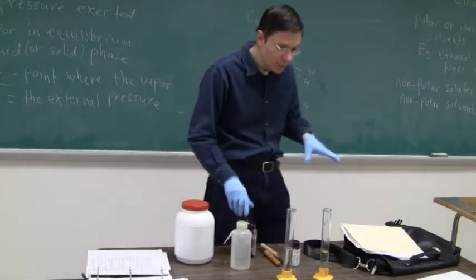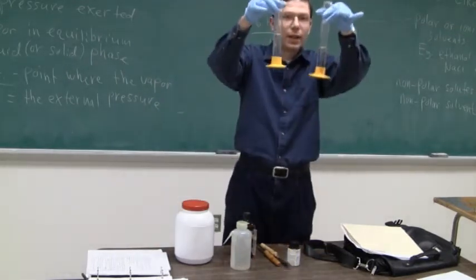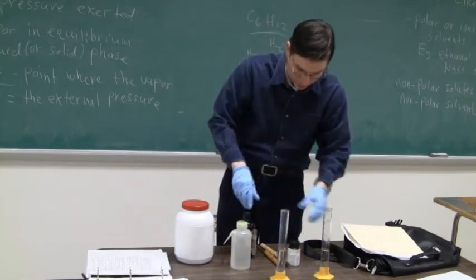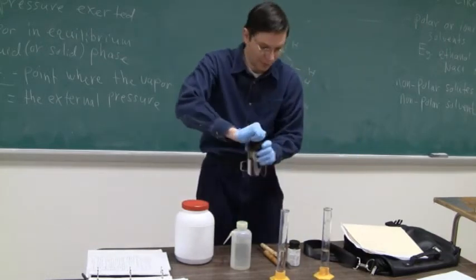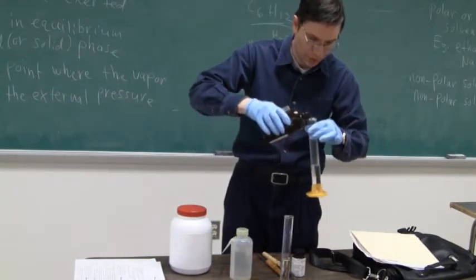Alright, so that means that in these graduated cylinders that I have here, if I pour some cyclohexane in there, it should not mix. So let's see what happens here.